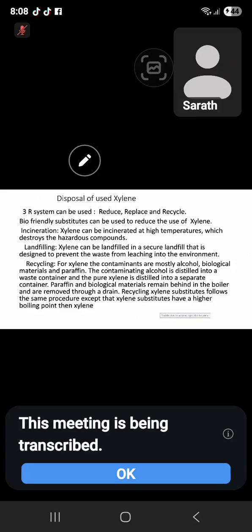Then recycling. In xylene, the contaminants are mostly alcohol, biological materials, and paraffin. The contaminated alcohol is distilled into the waste container, and the pure xylene is distilled into a separate container. Paraffin and biological material remain behind in the boiler and are removed through the drain. So you can take the alcohol and the xylene in that machine.